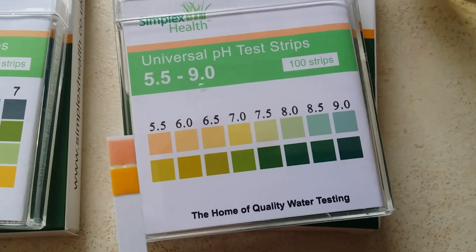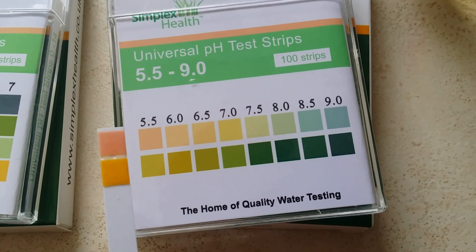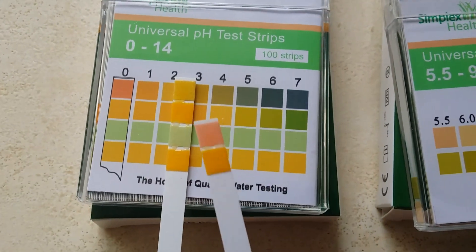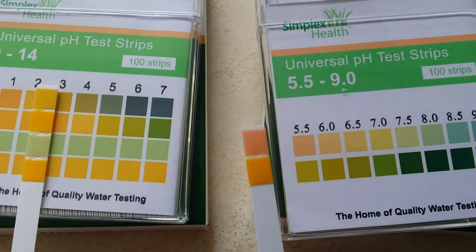If these colors were to continue, that just shows how it works — it would be a very acidic range. But you'd obviously look at that particular strip and get the results.